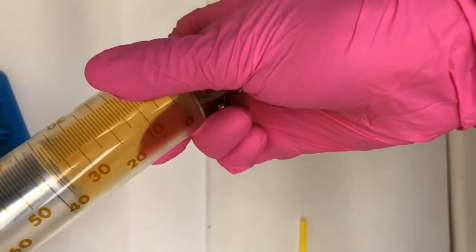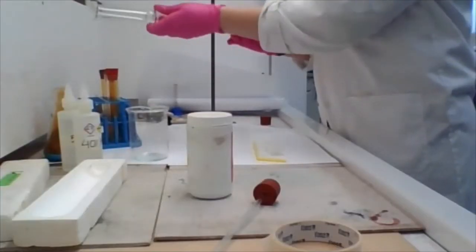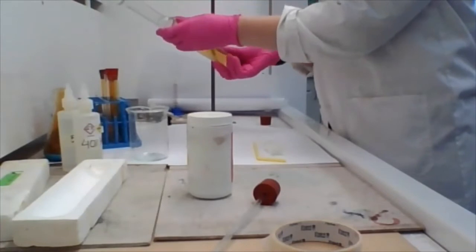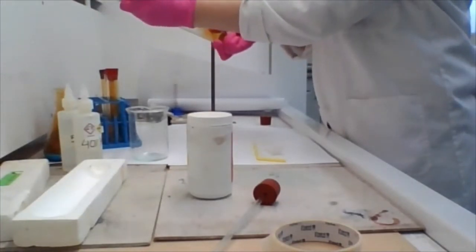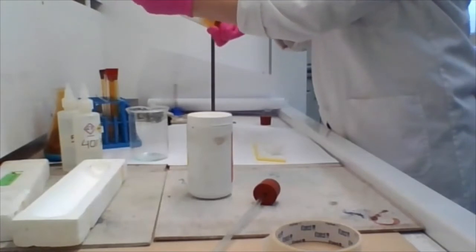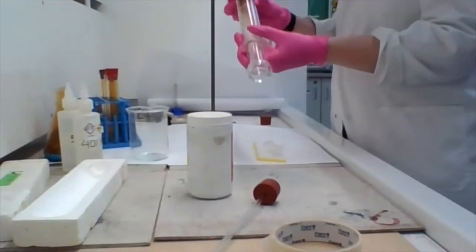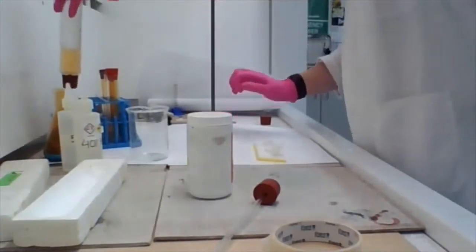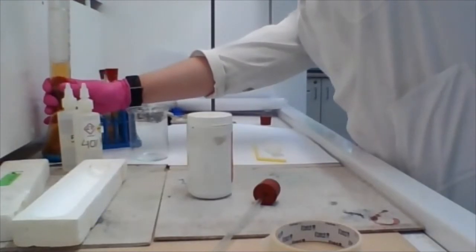Okay, so I pushed down on my syringe and you can see all of that gas has just come straight out. Because of course it did. So just to see my failure from another angle. There you go. So what I ended up needing to do was to refill my syringe. Another reason I muted myself is that was quite frustrating and there were a few swears.